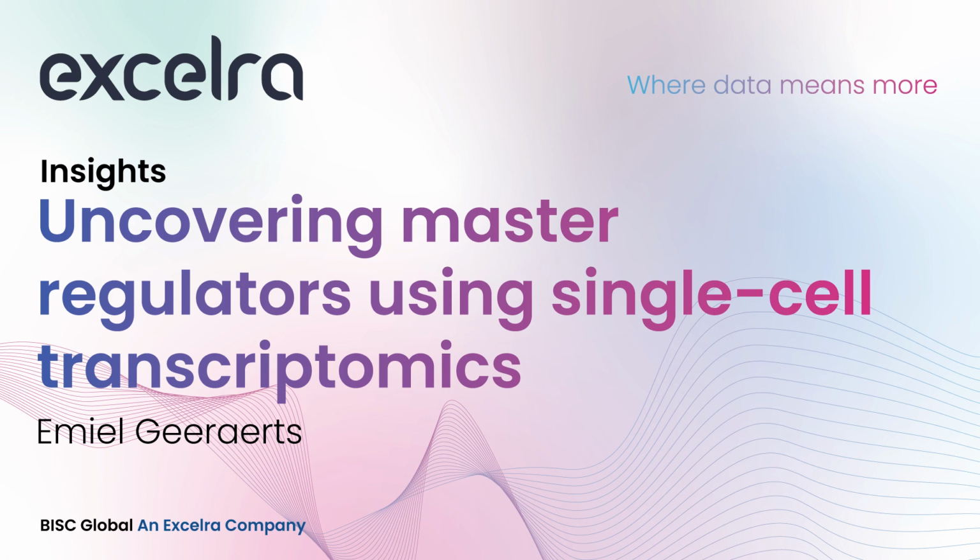Good. So I'll talk about uncovering master regulators using single-cell transcriptomics. Today we're going to dive deep into single-cell sequencing and gene regulatory networks. Don't worry, I'll introduce both topics first, after which we'll dig deep into one of my favorite tools for this kind of analysis. It's called SCENIC. I will end with two real-life case studies where we applied SCENIC to help clients.